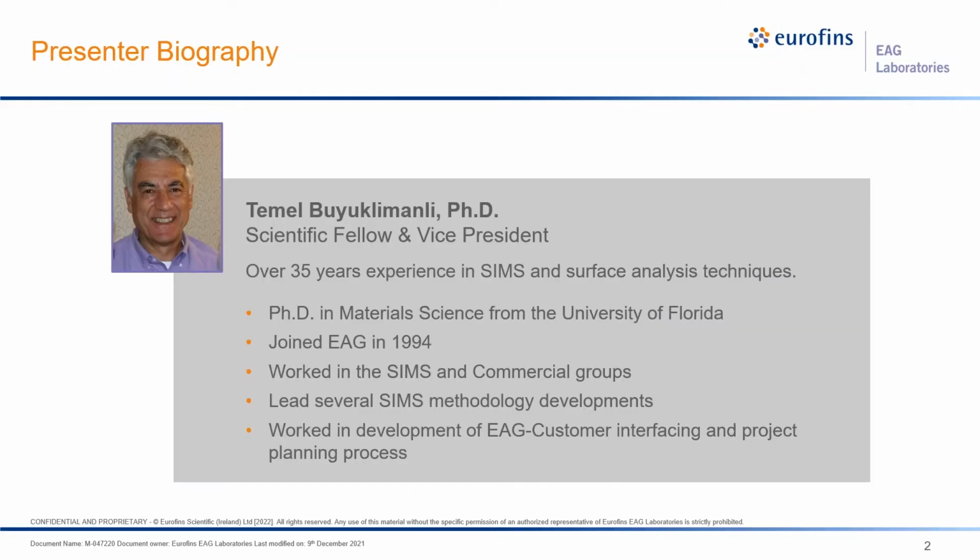I got my PhD in material science from the University of Florida. Since then, I have had many years of experience in surface analysis, specifically SIMS. I joined EAG in 1994, and ever since then, I have spent most of my time in secondary ion mass spectrometry analyses and development. I have worked on several methodology improvements to device analysis, specifically compound semiconductors, and we're going to show a few examples of those today.